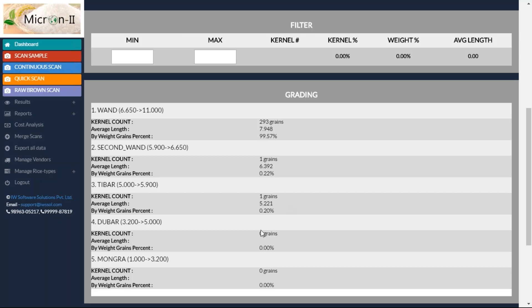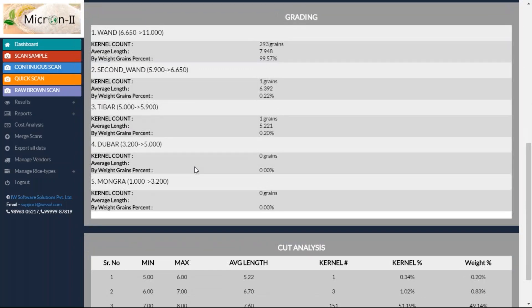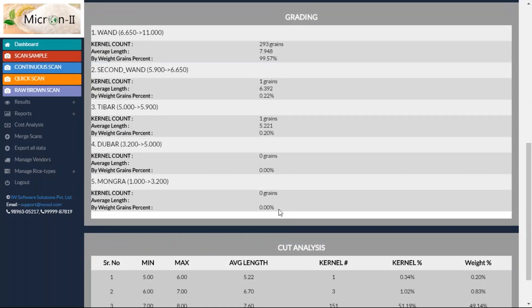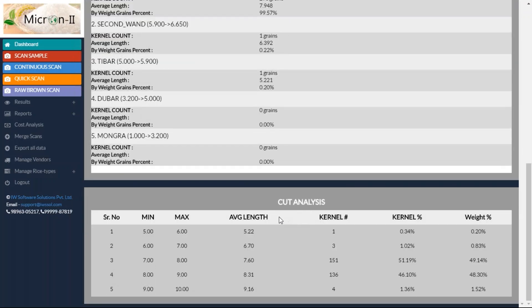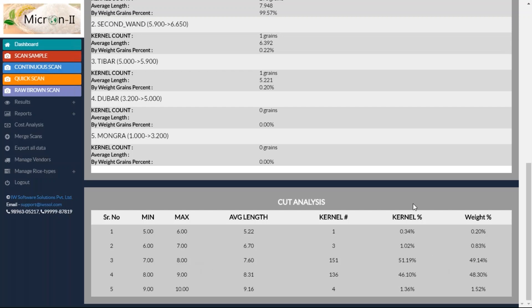Accordingly, Dibar, Mongra — if there are grains belonging to these categories, they will be reported too. You can increase or reduce the number of categories and their length ranges as per your grading system. Then, this is cut analysis. Cut analysis says 5 to 6 mm, you've got 0.20 percent of the grains; 0.83 percent belongs to 6 to 7 mm; 49.14 percent for 7 to 8 mm grains, and so on.